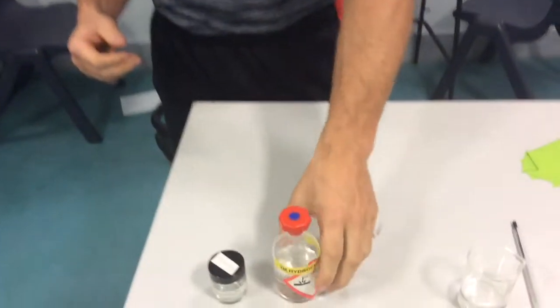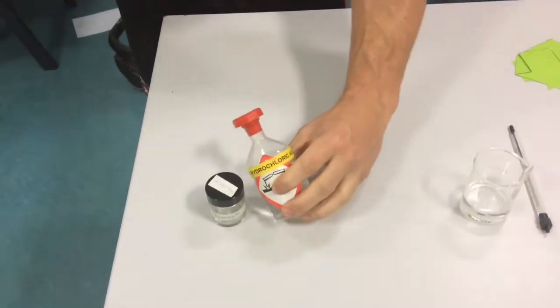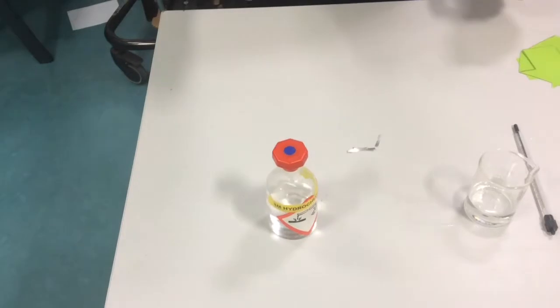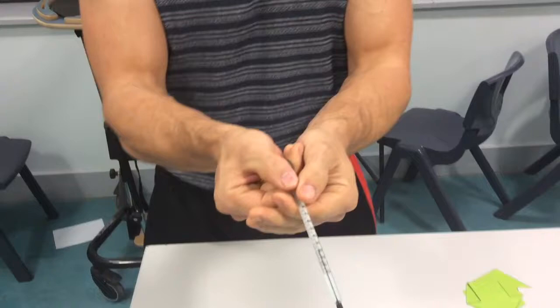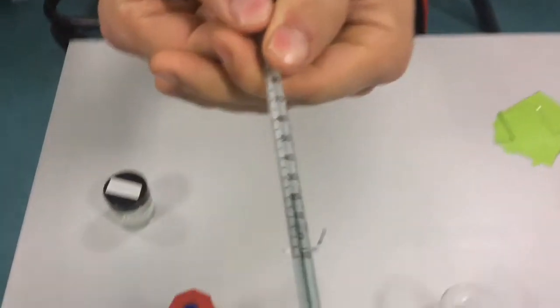So if you come over here, I've got a little bit of hydrochloric acid and a bit of magnesium. Now if you look on my thermometer, this is room temperature, around 23 degrees.